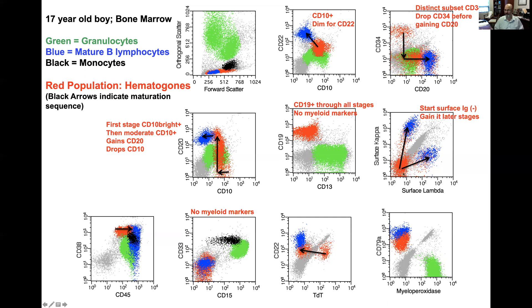Hematogones, as immature B cells, start negative for surface immunoglobulin. As they mature, they will either become kappa positive — a nice streaming of these cells — or gain surface lambda, to eventually become mature B cells. For CD45, hematogones start CD45 dim positive, then become moderate positive, and eventually bright as they become mature B cells.